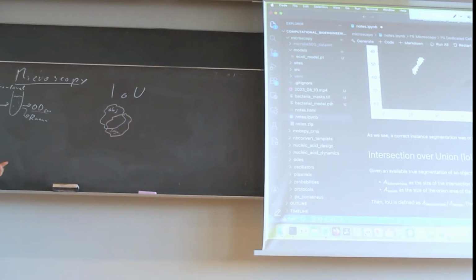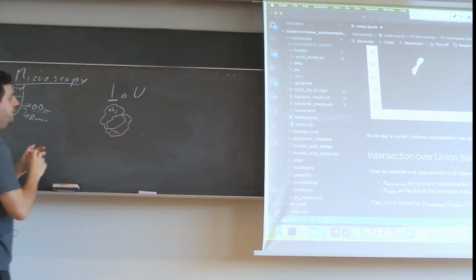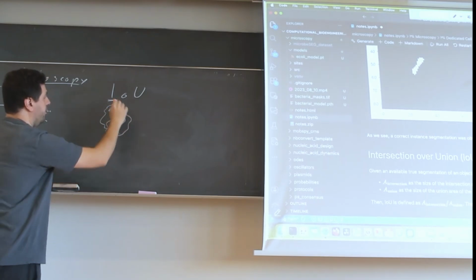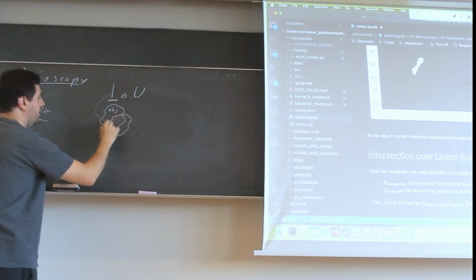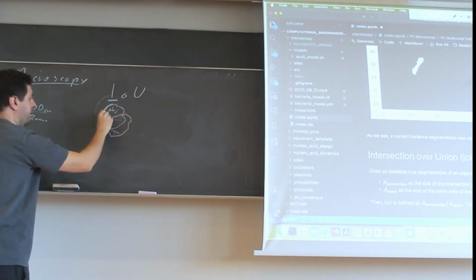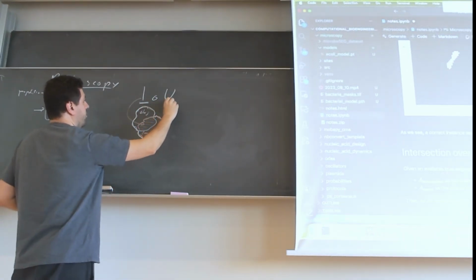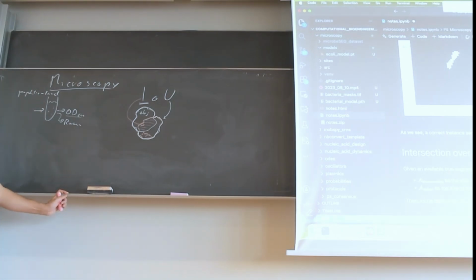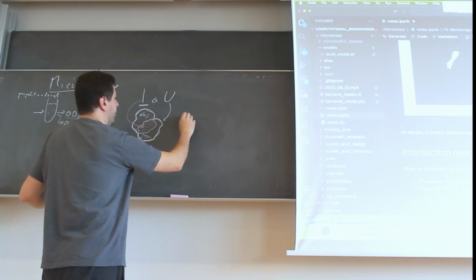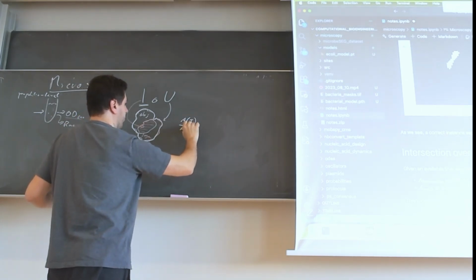And what you can ask now is actually to compute the intersection. The intersection of the two would be this part here. That's the intersection. And then what is the union? The union is like this outside area here. And when I say compute it, I'm referring to the area, for example, the number of pixels in this case. And then you are just taking the area of this intersection divided by the area of the union.